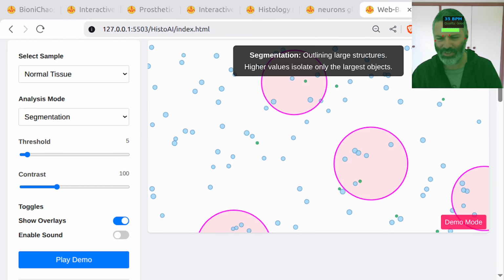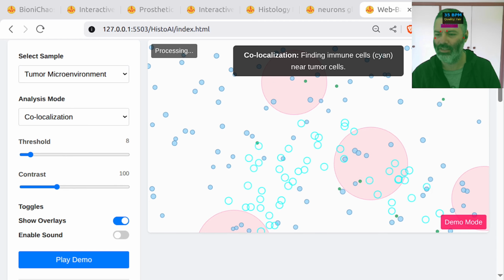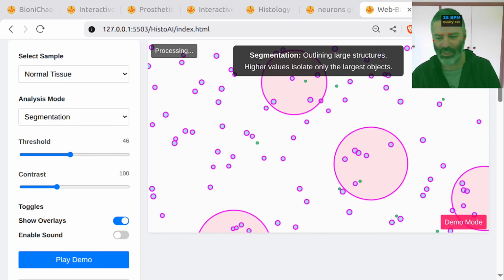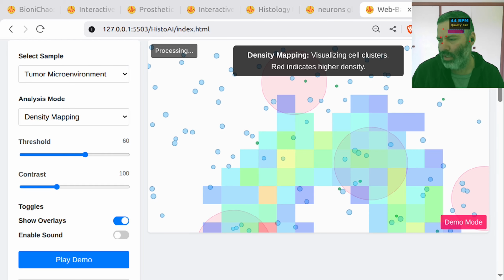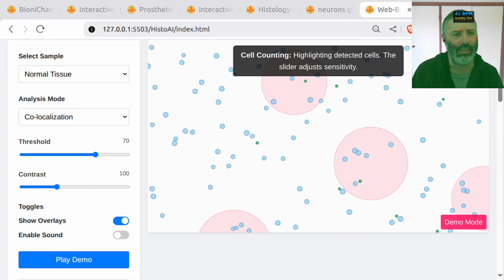Is it really doing it like that? Highly doubted. Highly doubted. There's no way. It's not doing anything. Pretty sure. I don't know why it even says it. It's really weird. It's not to do with the model. It's to do with how it's being implemented, kind of thing.